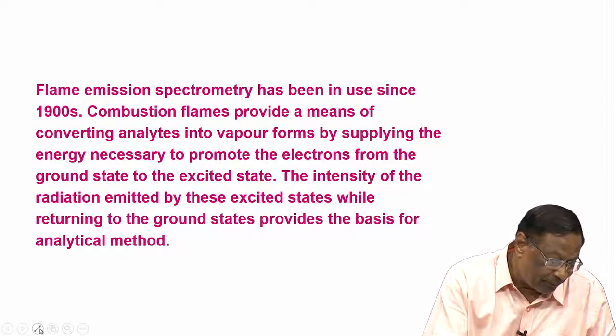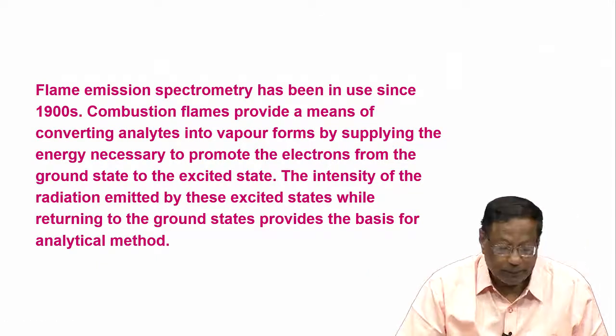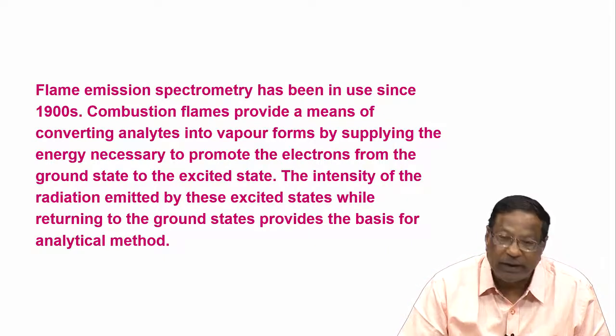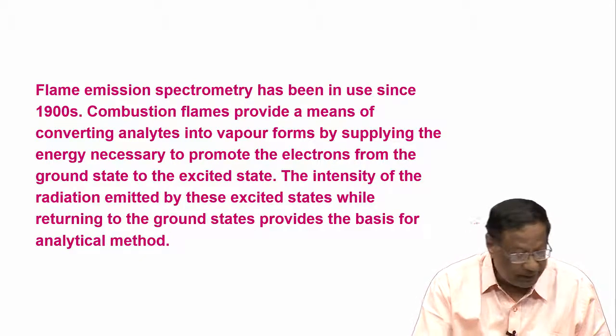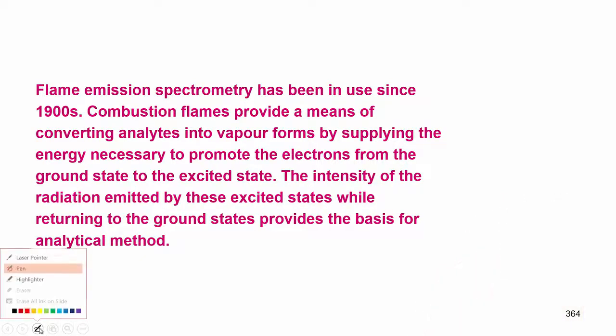provides the basis for analytical method. What we want to say essentially is, we have a ground state atom here and excited state is here, and then I have an electron here, this goes to the next higher energy state. If I put it in the flame, this is absorption.